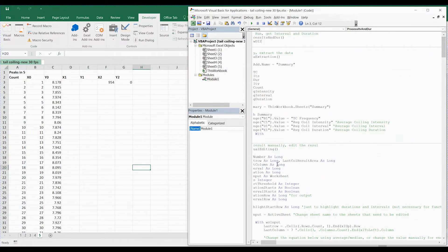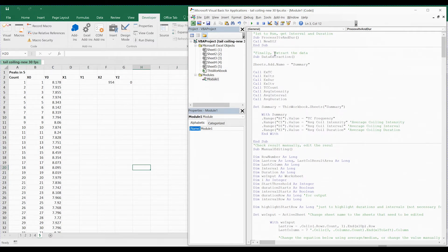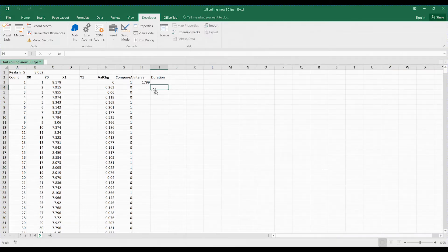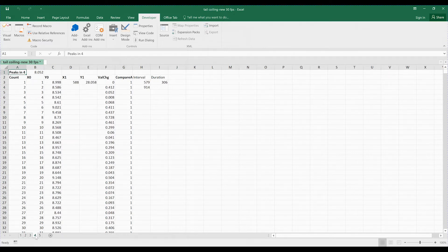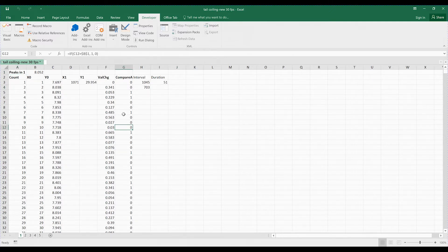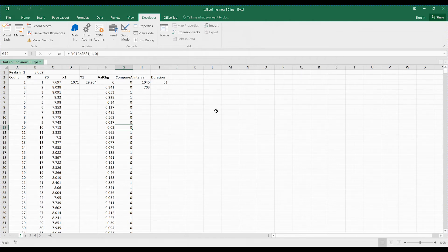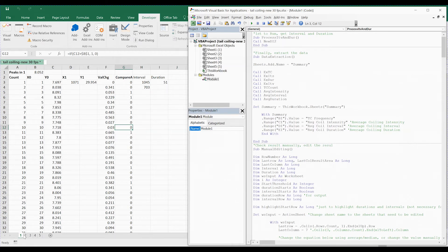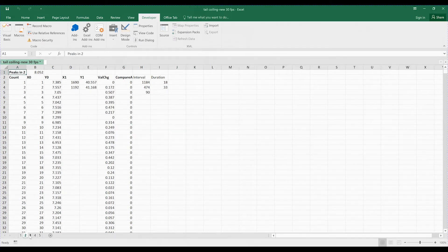Now I will run Process ITV/Endure to get the result. After running it, you can see that it will add several new columns called Interval and Duration in all the sheets. You just need to check whether the duration makes sense compared to what you see in the video. Here it's around 51 frames — that should be OK for this one.